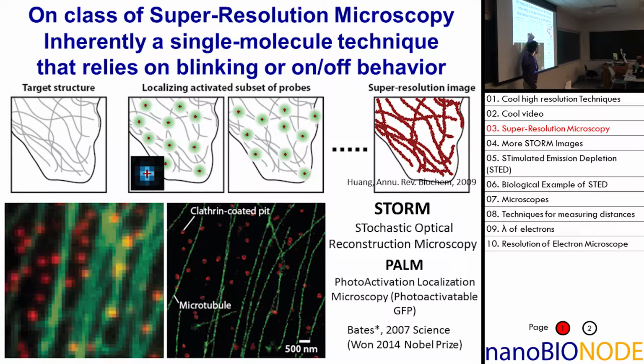And in general, a different one is fluorescing. And so you do it again and again, and eventually you can get your nanometer type of resolution. So this is the normal resolution, and this here is the STORM resolution.